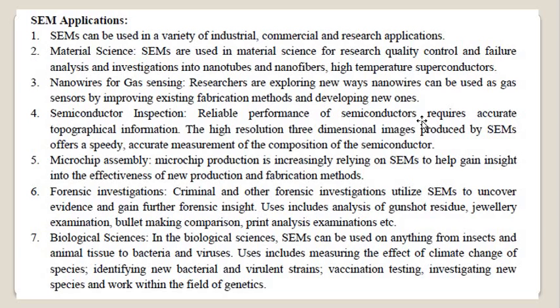Even vaccination testing, this SEM is also useful. Investigating new species and work within the field of genetics, this SEM is also helpful.